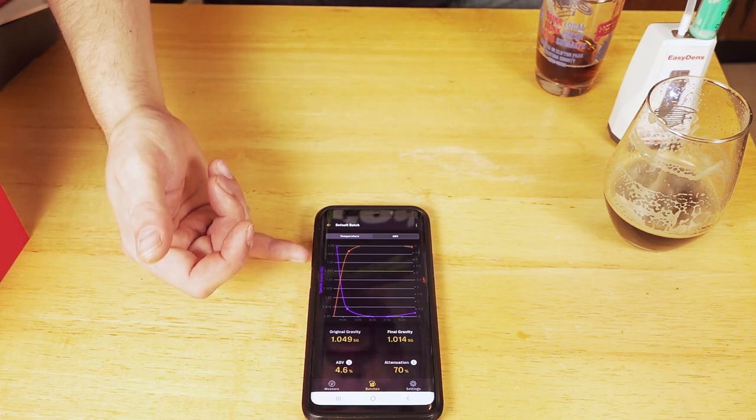For cons on the EZDense: it's stupidly expensive and really easy to break — if you drop it you'll likely break the internal tube, so be careful. At the end of the day, no matter what you're buying, you're going to be doing the same thing with it. Whether you go with a five dollar hydrometer or a $350 EZDense, all that matters is that you know what you're doing. The biggest factors are how much convenience matters to you, whether you care if your measurement is off by 0.002 specific gravity points, and whether you want to plug things into calculators or just see the reading as it is. Those factors will probably dictate how much money you spend.